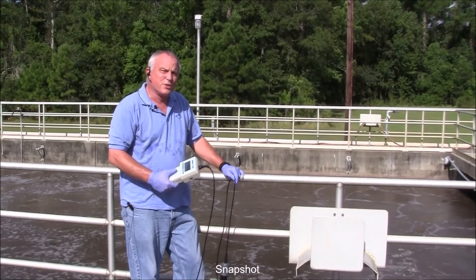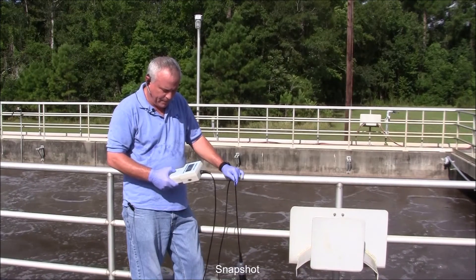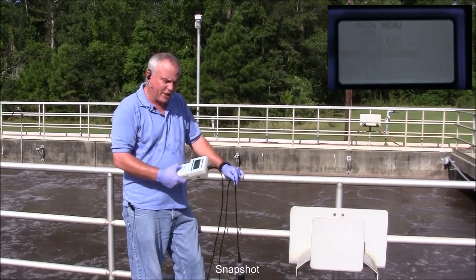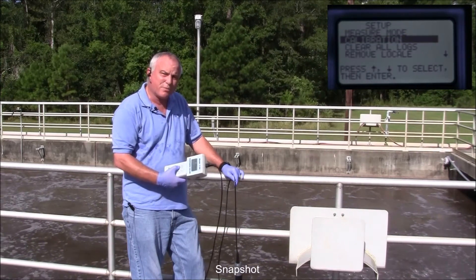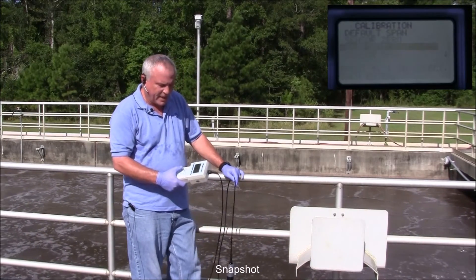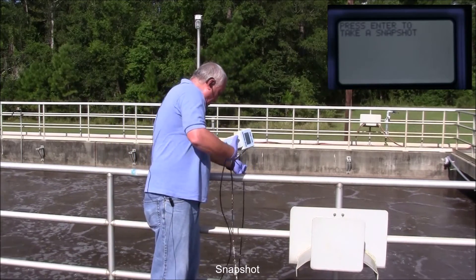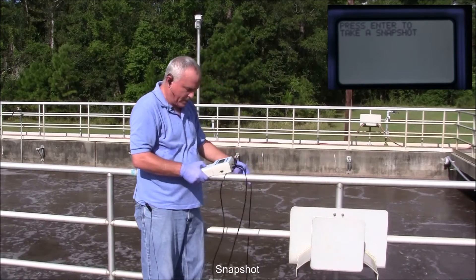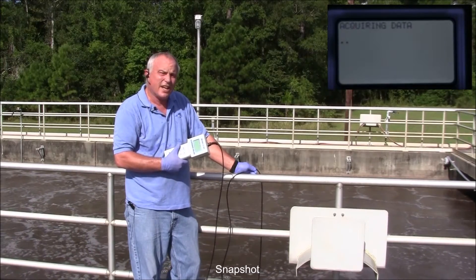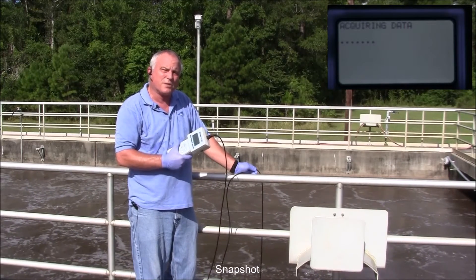The next step in the calibration is to do a snapshot. To do that, turn the unit on, press the menu button, scroll down to setup, press enter, scroll down to calibration, press enter, scroll down to snapshot, press enter. It says press enter to take a snapshot. At that point, put the sensor down in the process, then press enter. It's going to say acquiring data, it's going to take about 15 seconds, and then it's going to come back to the menu mode. At that point, you're done with the snapshot.